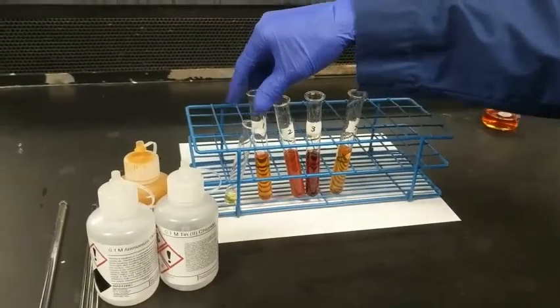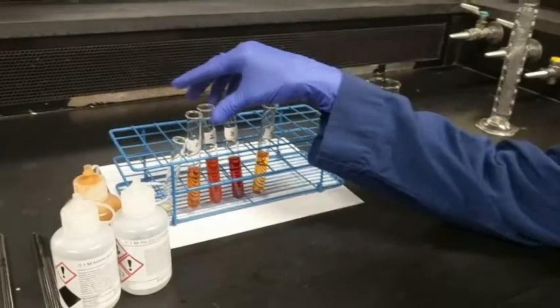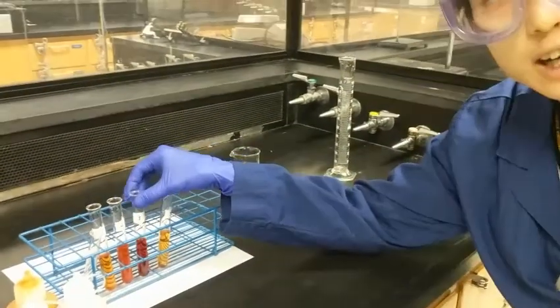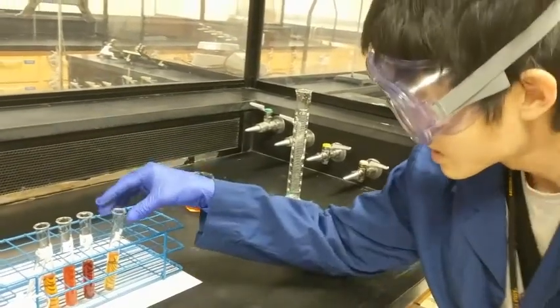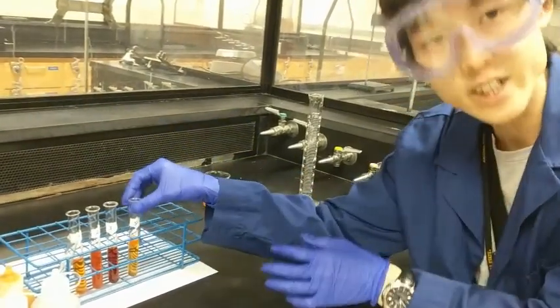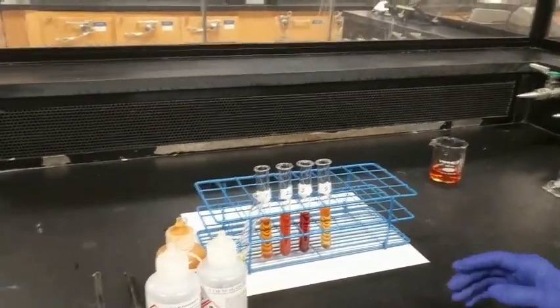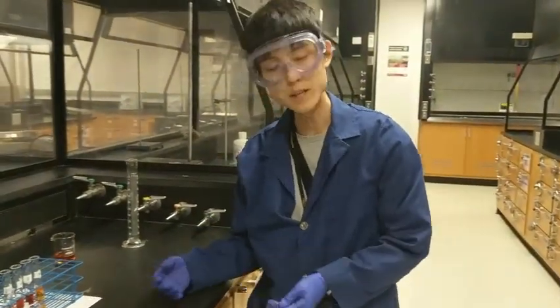Now, as you can see, the second test tube has a slightly darker red than the control. The third test tube also has a darker red color compared to the reference solution. For the fourth test tube, you see a slightly lighter color than the control. So based on the color, please predict in which direction the equilibrium shifted, and please explain the phenomena based on Le Chatelier's principle.